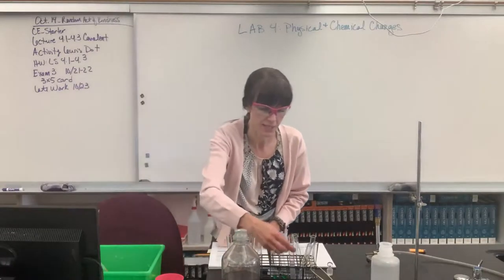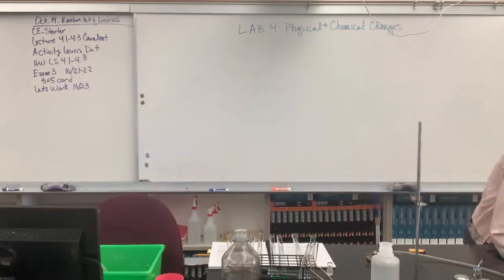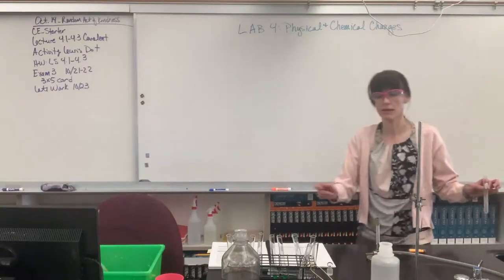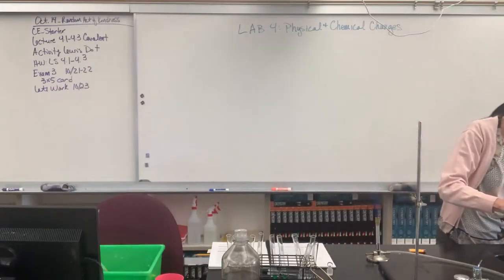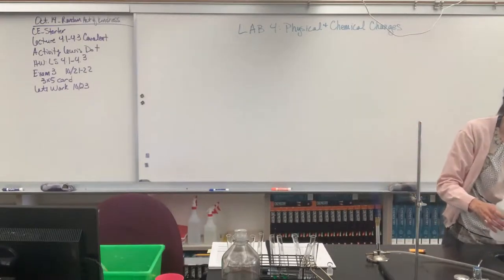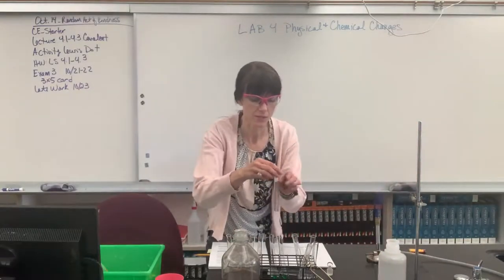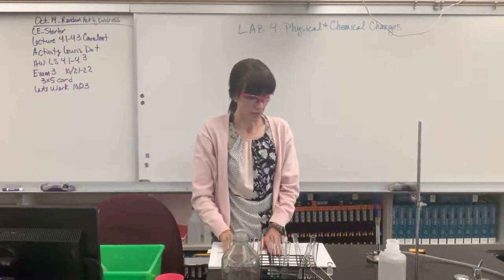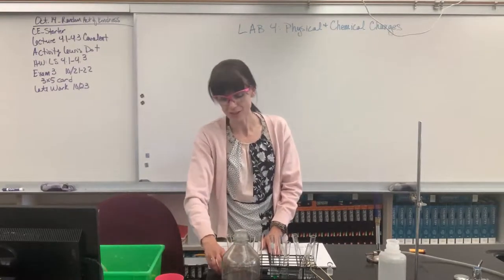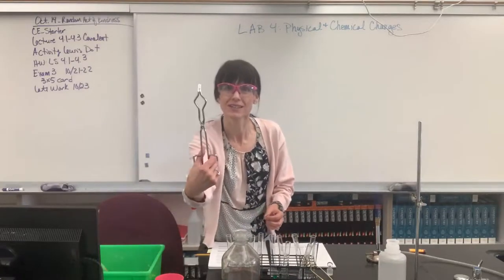I'm going to get this test tube ready to do that. And I'm going to rinse this one out. I was one test tube short, you guys. Sorry about that. Okay, so I have my test tube ready to go. I have my other piece of metal. There it is. And let me show you my crucible tongs. These are crucible tongs right there.